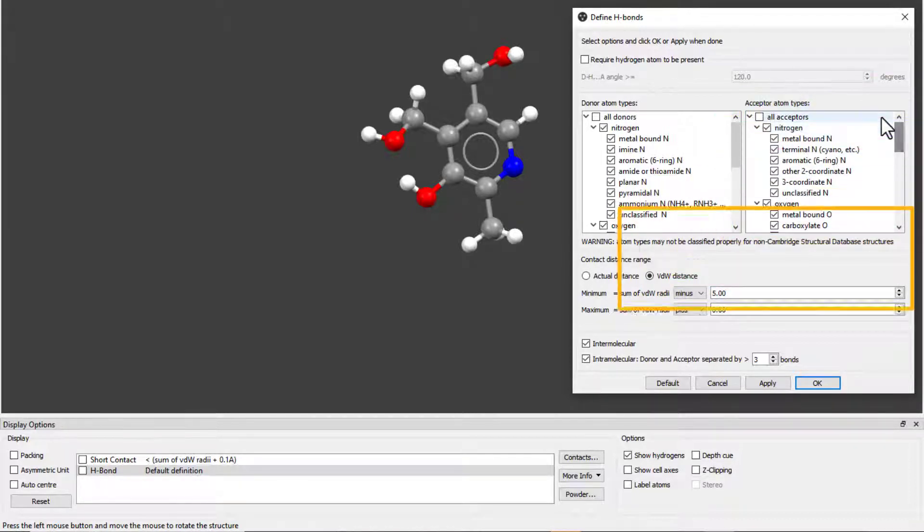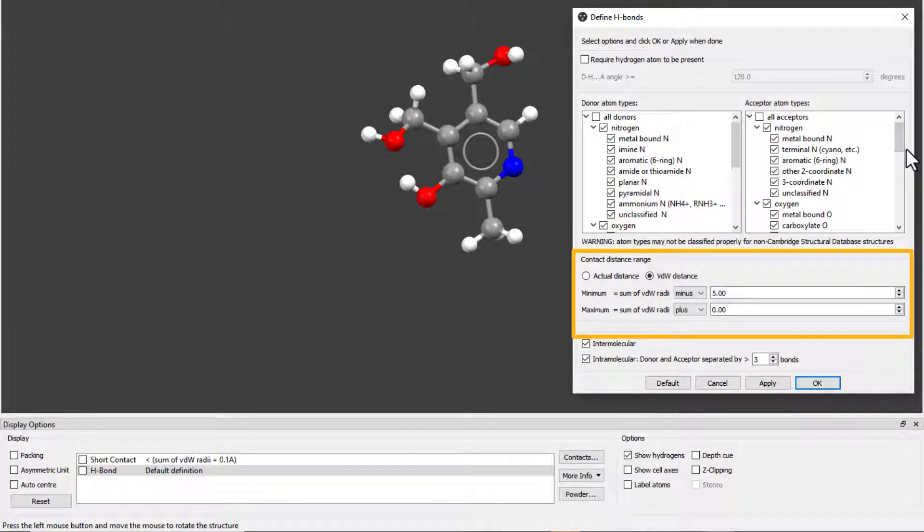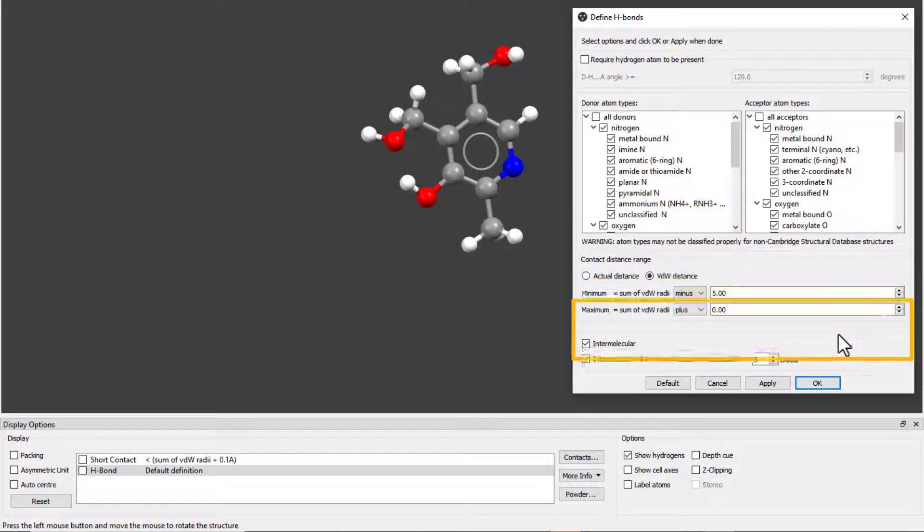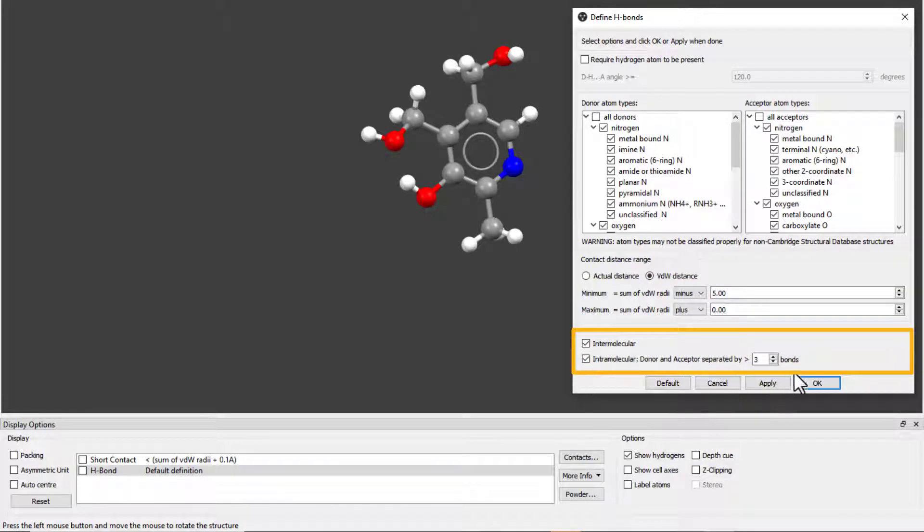We can edit the range for the distance of the hydrogen bond interaction, either using the van der Waals radius as the unit or the actual distance between atoms. And we can also select to visualize either intermolecular contacts or intramolecular contacts or both.